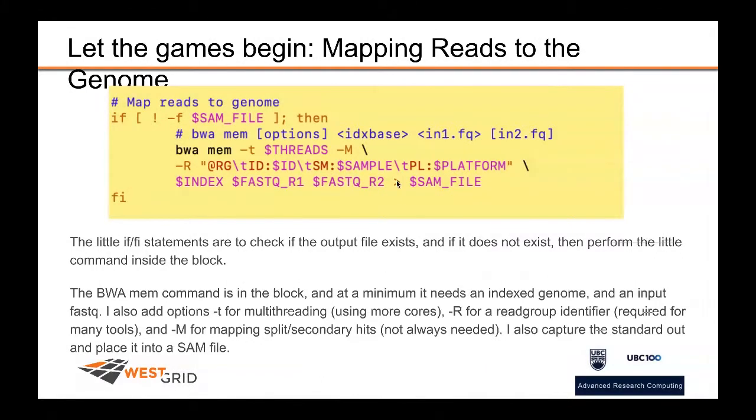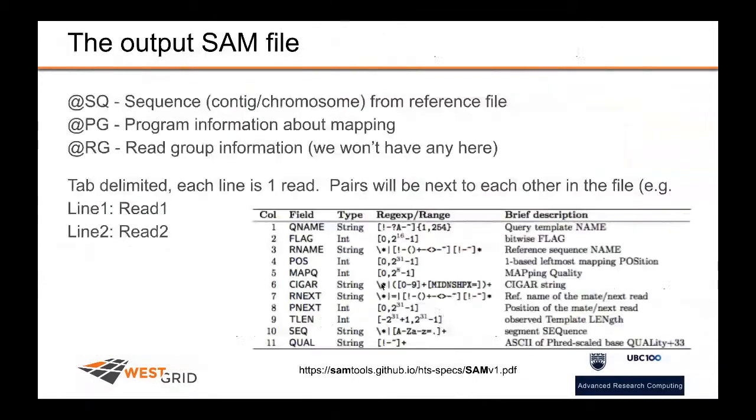Lastly, we are going to capture the output. This would print just to standard out. Instead, we're going to capture that within a SAM file. So the output of this is going to be, as I just said, a SAM file. And a SAM file, again, is a standardized format.